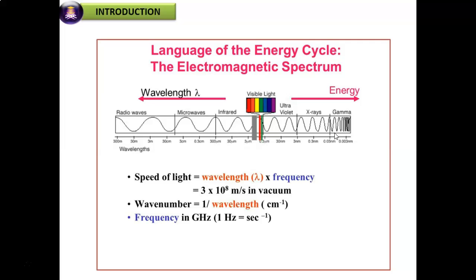So the electromagnetic spectrum is made up of many different kinds of radiation, from low frequency, low energy radio waves with long wavelength to high frequency, high energy gamma rays with short wavelength. So high energy will produce short wavelength. This experiment targets the visible region of this spectrum specifically because we can see the electromagnetic radiation with wavelength in this region with our own eyes, right?